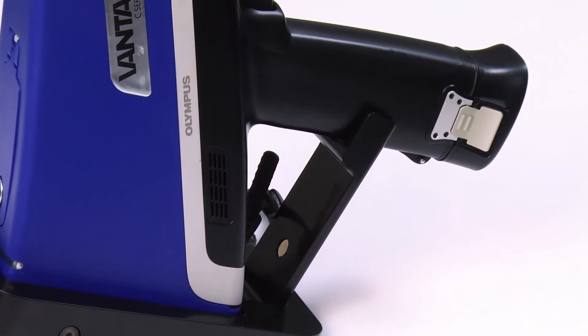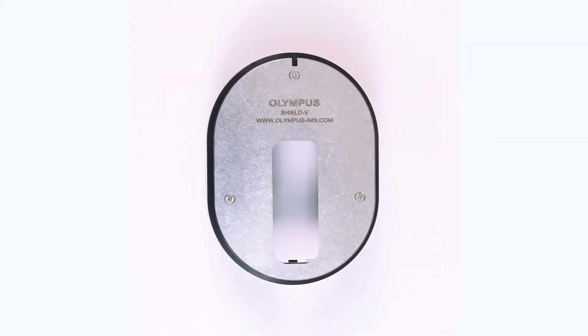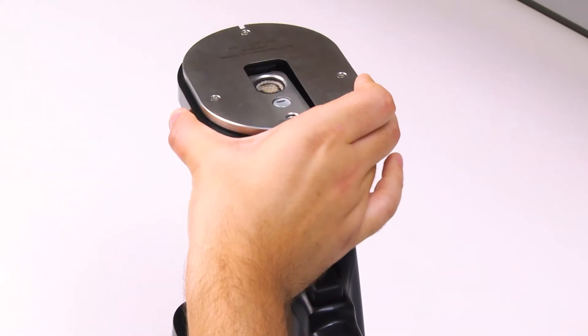Once the Vanta is secure in the base, you can attach the deck. Place the deck onto the Vanta, lining up the Olympus logo with the top of the Vanta, and slide into place until you hear a click.